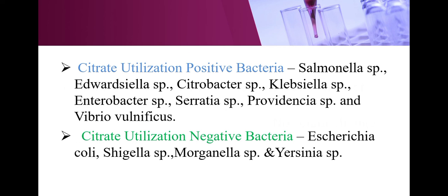These are all about the enzyme-based biochemical tests of IMViC.